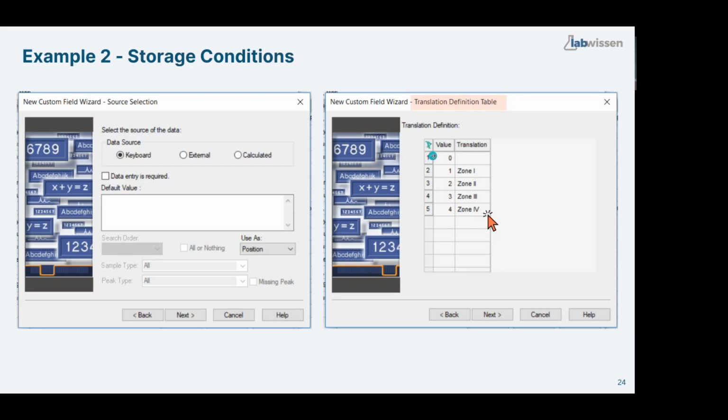Values always go from 0 up to, I have no idea what the limit is. So you can really enter many, many options here. I have never heard that somebody came to the limit, so I have no idea how many it is. Is it 100 or 200 options? But I suppose when you create drop-down lists, you never need so many options. Here in my case, I have 4, but actually I put 5 here.